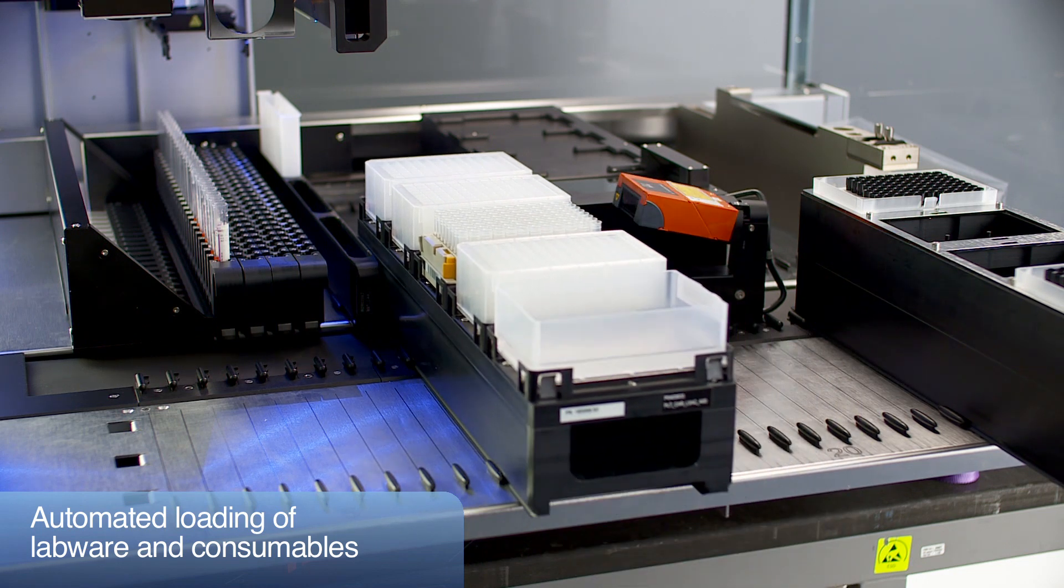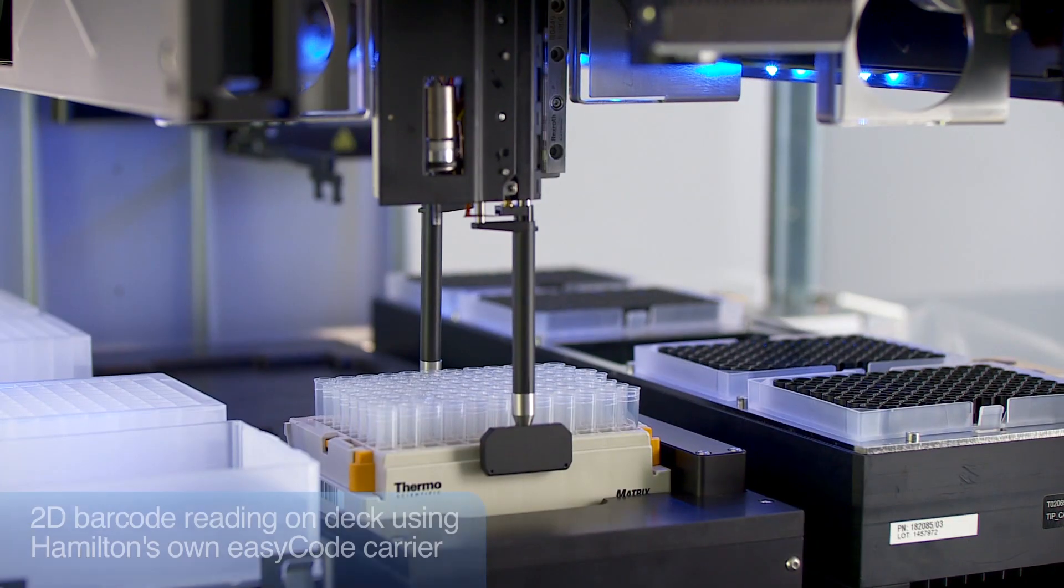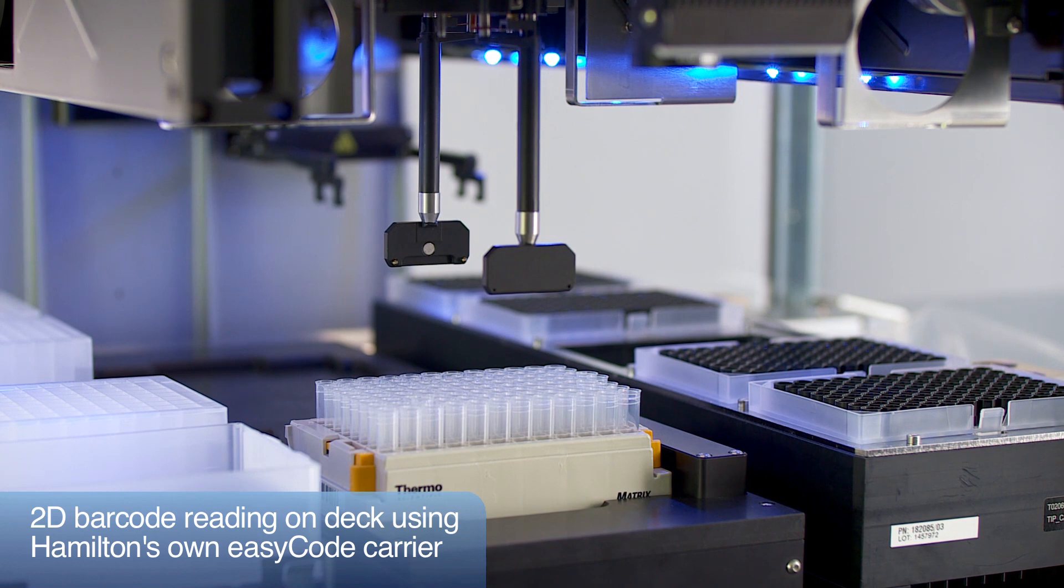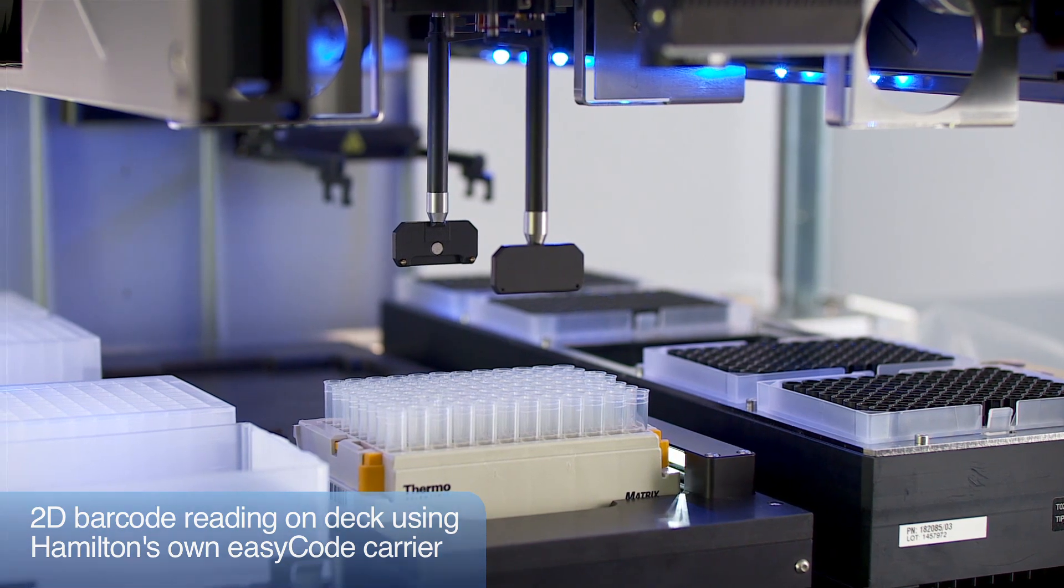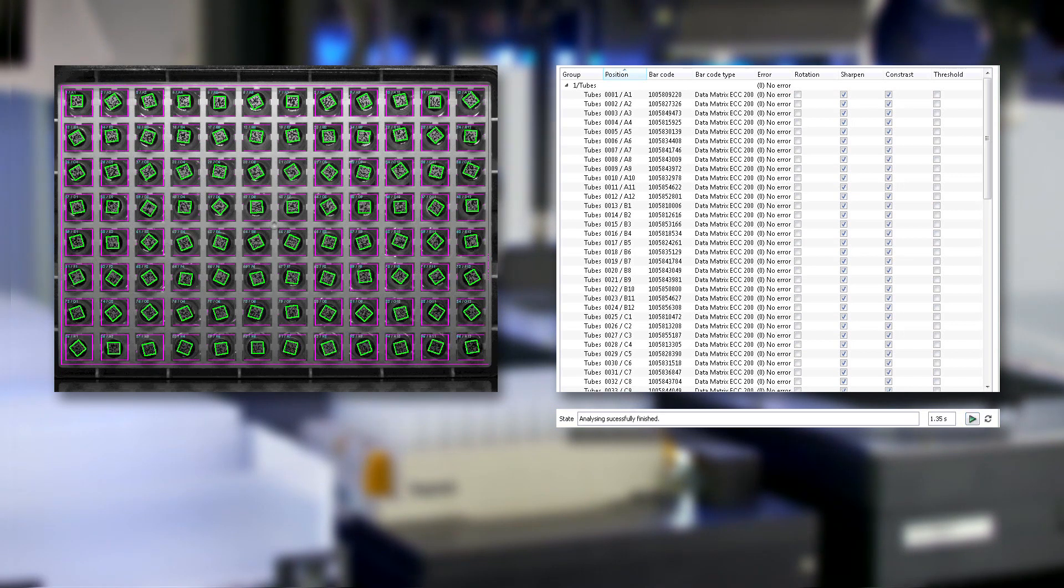Target labware as well as consumables are also automatically loaded. The space-saving integration of Hamilton's EasyCode 2D barcode scanner allows a cost-efficient option for on-deck target container identification.